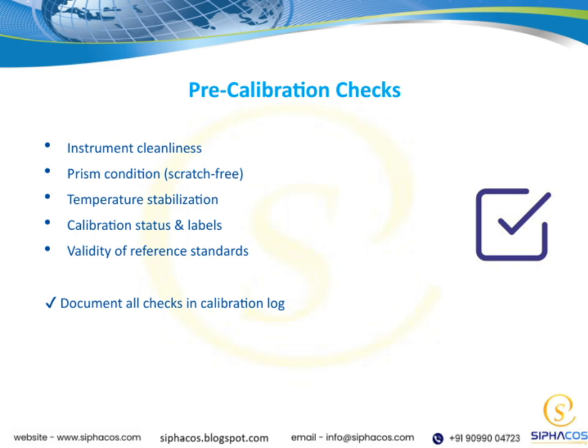Make sure the instrument is properly calibrated and the labels are up to date. Finally, verify the validity of reference standards. These standards should be current and within their usable period to guarantee reliable calibration.